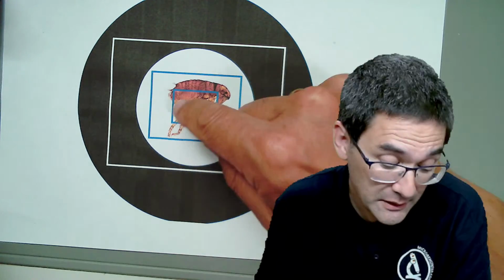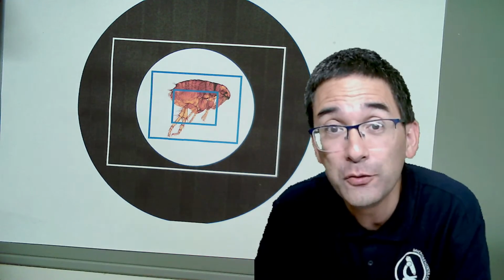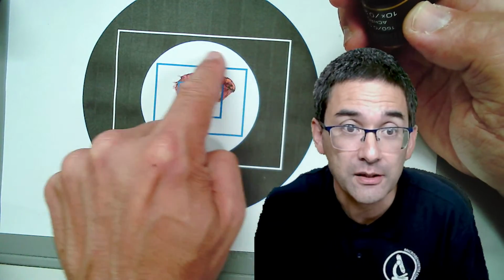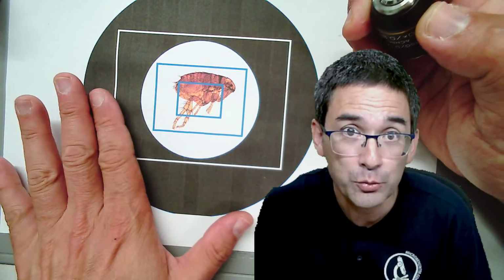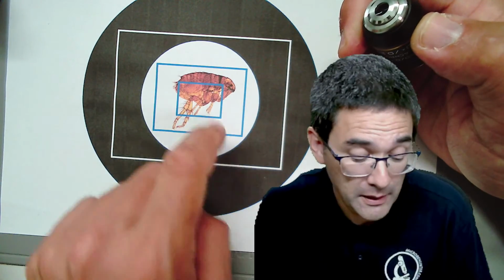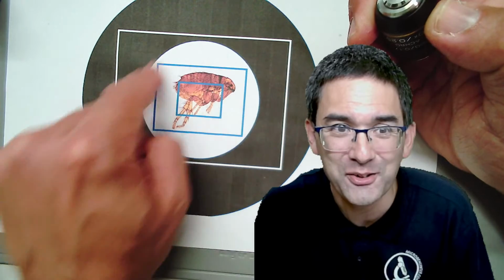The question is now the following: does a small field of view also have an advantage? And yes, there can be advantages as well. For example, if your microscope objective is not very good, if it's not a plan objective, then the side over here might be fuzzy. It might be a little bit blurry. You need plan objectives, and if you have plan objectives, then everything is going to be very clear. But if your objectives are not so good, and you only capture a central portion, then actually you don't see the fuzziness on the outside here.